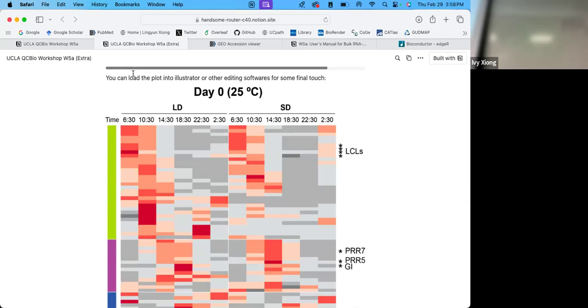So what you want to do actually is a really good way to get it. The other way to do it, if you do, is a good foundation, but I still have to work on it. This will get the size of the files. So now we know where this came from. Oh, you can check anytime.